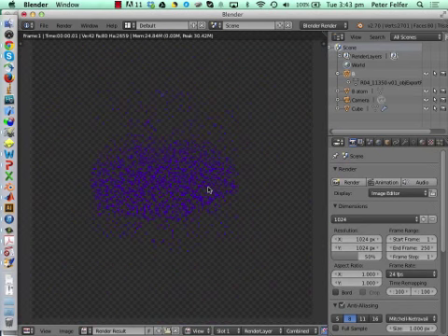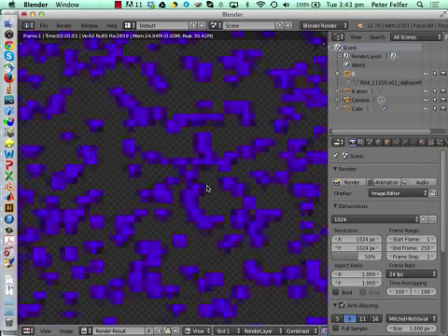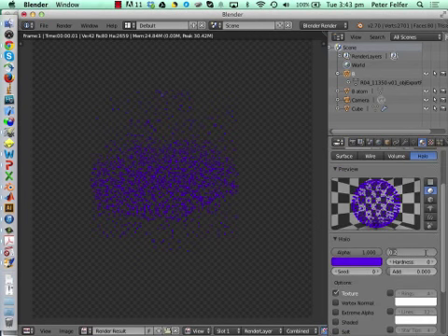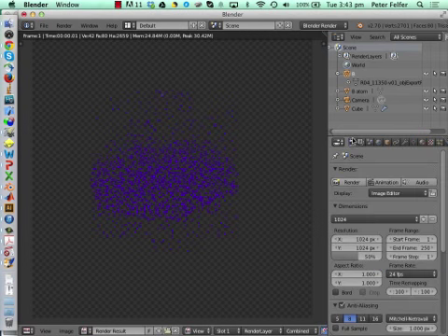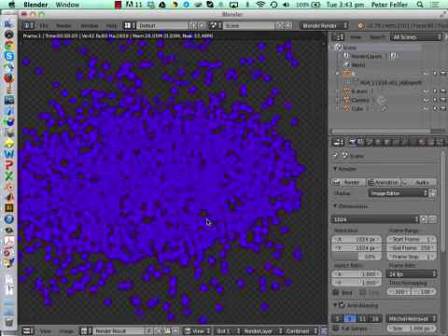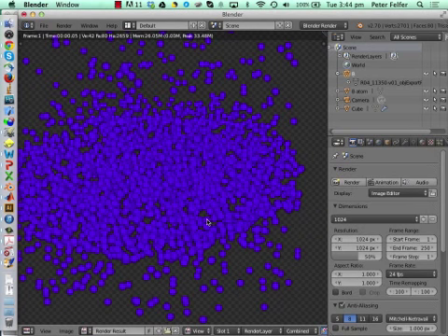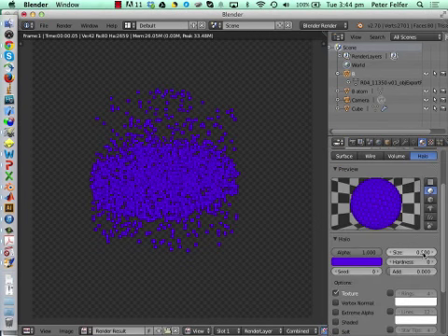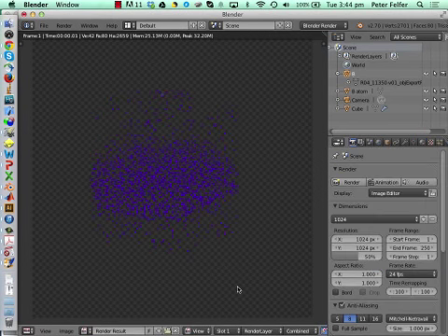Now we render it and we've got our boron atoms. Yeah, if we would render at a higher resolution, it would look a bit nicer. I'll just make them large so that you can see what it would look like. But you've got your individual atoms now here. This is a very large data set. Usually if you have 10 by 10 nanometer cubes where you're showing details, that's a much better effect to use. But anyway, that's the other way of visualizing your atom probe data.